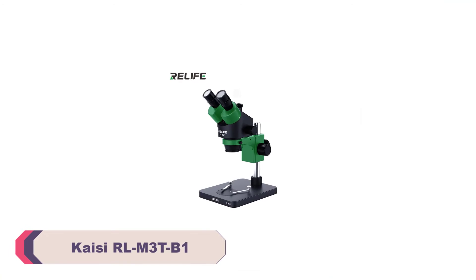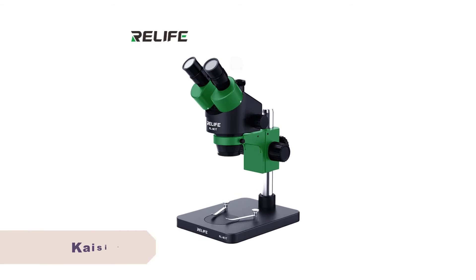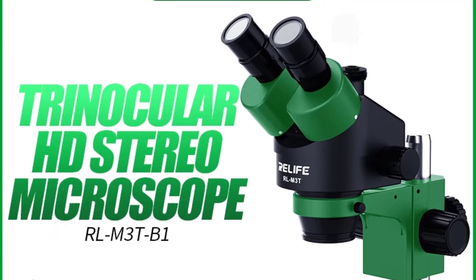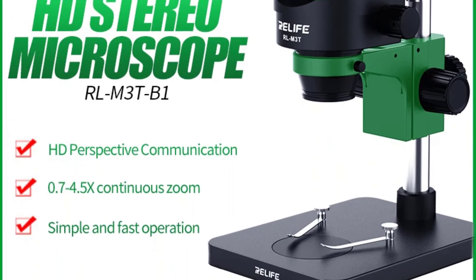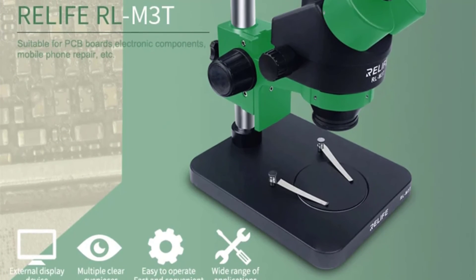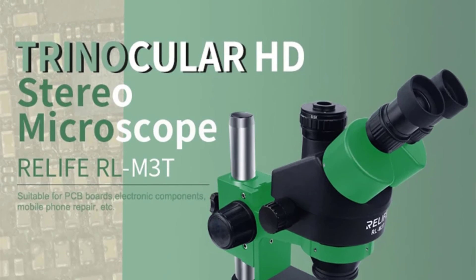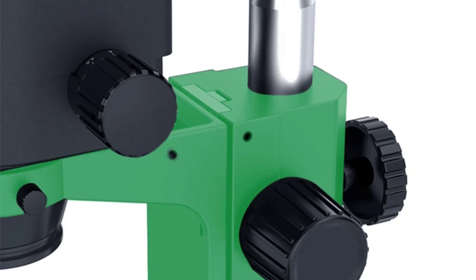Number 1: KICRLM3TB1 Trinocular Stereo Microscope. The KICRLM3TB1 boasts a high-definition optical system that delivers crisp and clear images. The stereo view provided by the two eyepieces is a game-changer when it comes to depth perception and fine detail examination. I have used this microscope for various applications, from examining biological samples to inspecting small electronic components, and it has consistently provided outstanding image quality. The trinocular design allows for the attachment of a camera or other imaging equipment, making it suitable for both professional applications and educational purposes, particularly useful for documentation and sharing observations with colleagues and students.